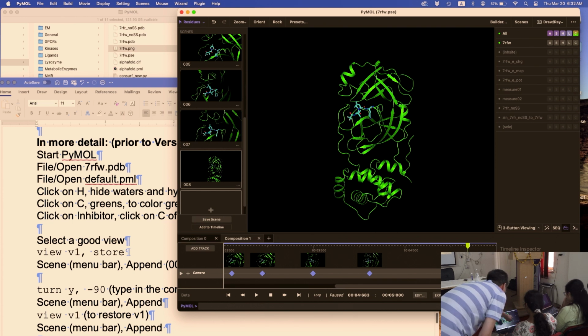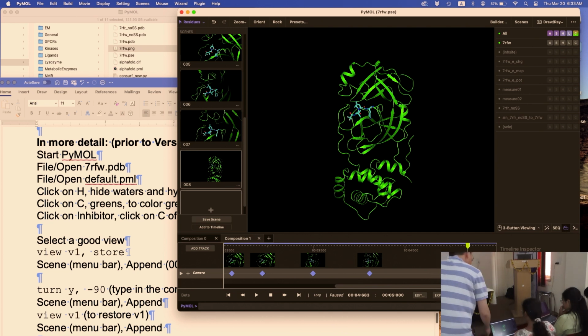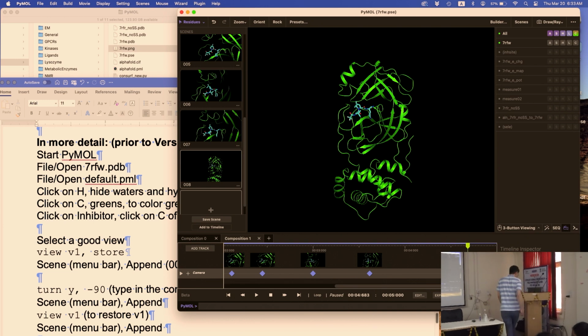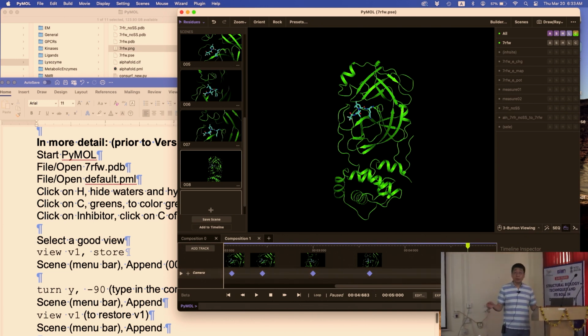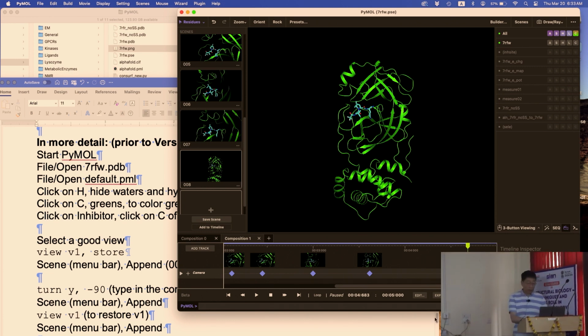All right. So, let me see. Program. And scene loop, or you did state loop, scene loop, steady. Steady. And then 1 second each. 1 second each. Right. And then a movie should show up. I don't know what happened to it. Oh, there you go. You have it. Now you play. Yeah, there you go. Because you're using the old version of PyMOL. That's why. Okay, so everybody has the scene set up? Yeah, okay. So now, whether you're happy or not, you click on play.